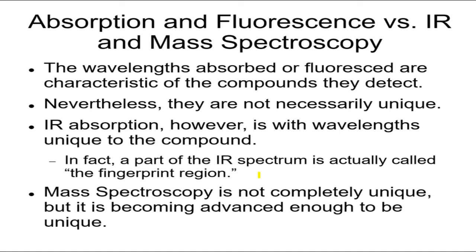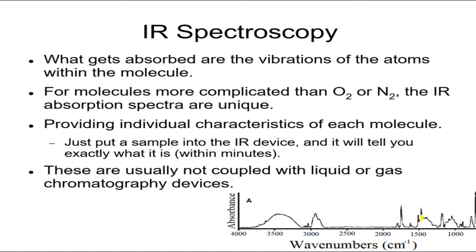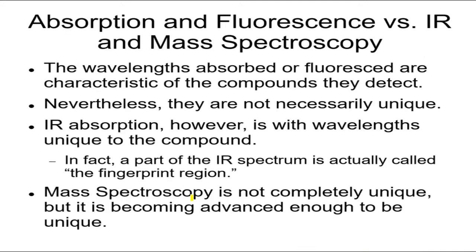Okay, and as we mentioned, that part of the IR spectrum, in fact, it's this part right over here, is called the fingerprint region because it's unique to every compound.